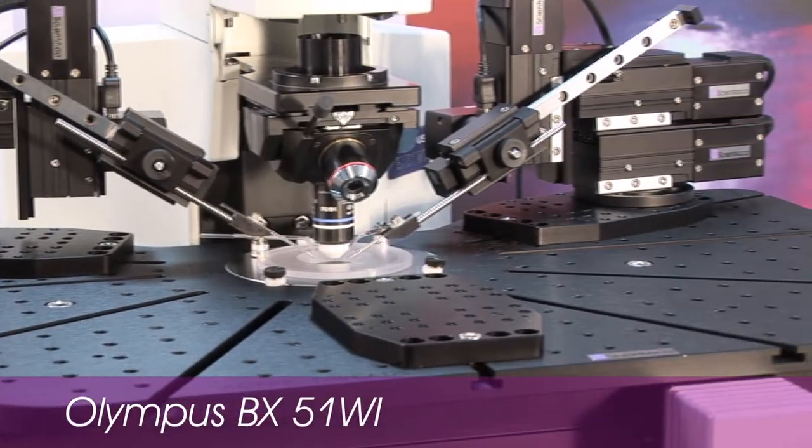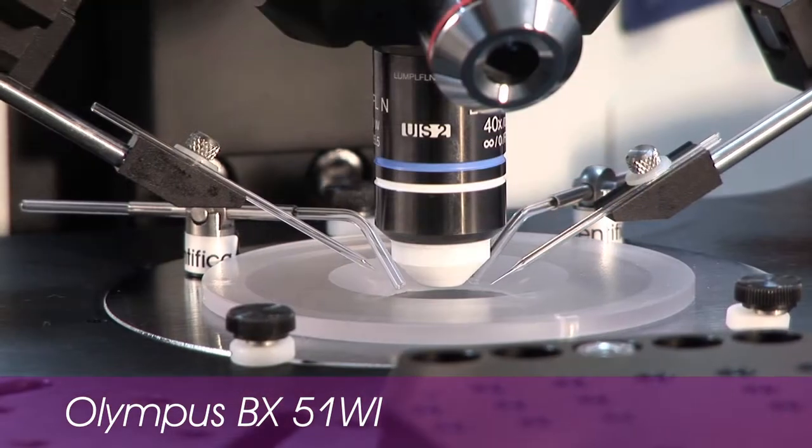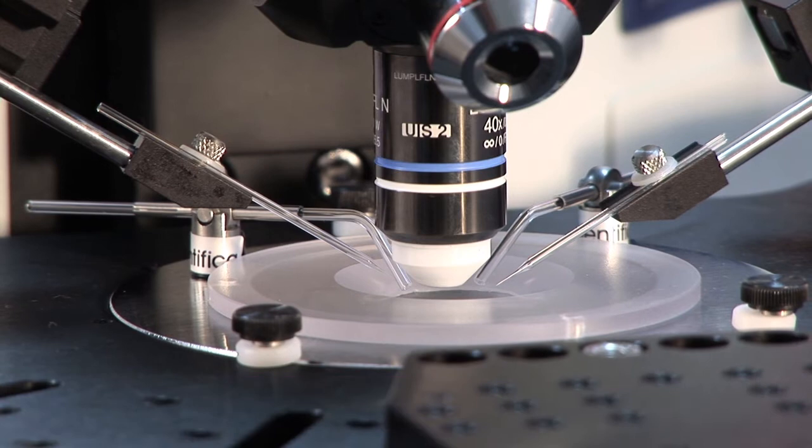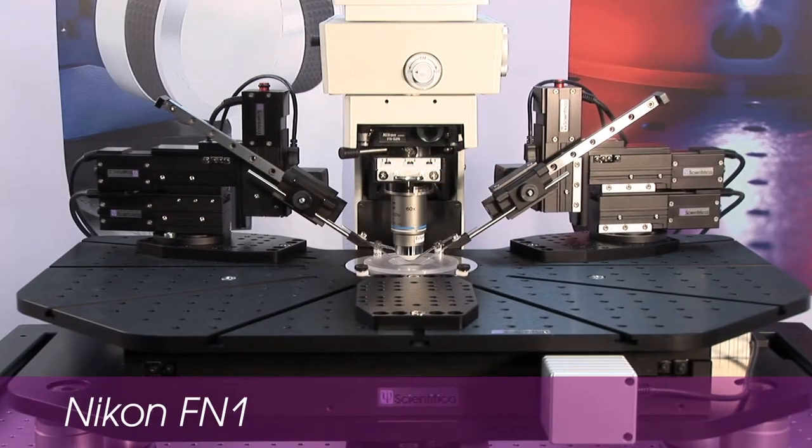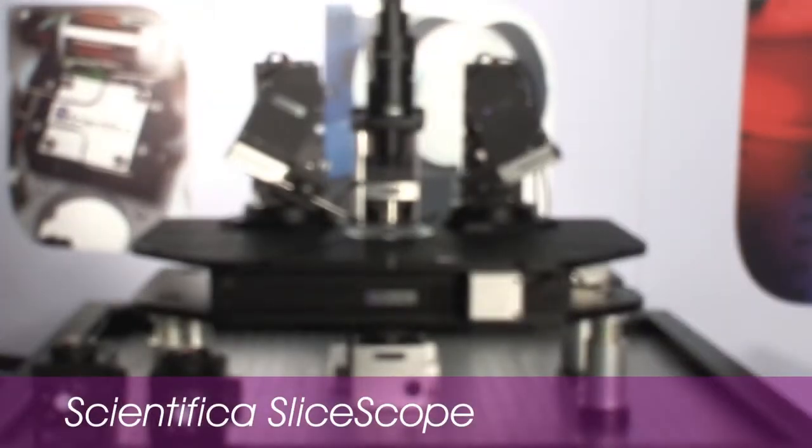We recognize that many labs will have a range of different microscopes, so we have ensured that the moveable top plate is compatible with Olympus, Nikon, Zeiss and Leica, as well as the Scientifica slimline slice scope. This greatly increases its versatility and usefulness within the lab.